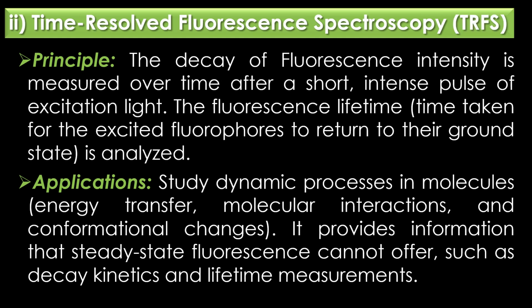The second type of fluorescence spectroscopy is time-resolved fluorescence spectroscopy. In short form, it is called TRFS. In time-resolved fluorescence spectroscopy, the decay of fluorescent intensity is measured over time after a short, intense pulse of excitation light. The fluorescence lifetime, that is, the time taken for the excited fluorophores to return to their ground state, is analyzed by using this time-resolved fluorescence spectroscopy.